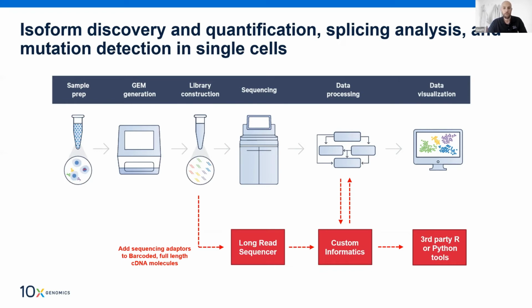But in summary, I hope that you now appreciate that through a relatively simple hack of the 3' or 5' kits, you can now access full-length transcript information from single cells that adds whole new layers to your biological insights.